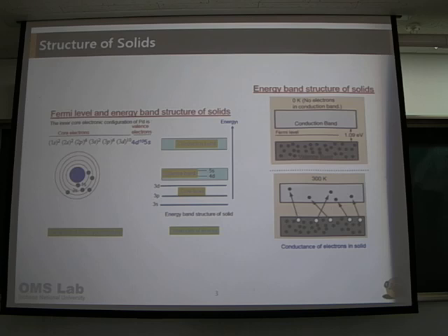Before discussing XPS, we have to know about the structure of solids, because XPS techniques are very related to the surface chemistry of matter. First of all, Fermi level and energy band structure of solids. In this case, the left figure shows the viewpoint of electronic structure. This is the inner core electronic configuration of palladium, and the right one is the viewpoint of energy.